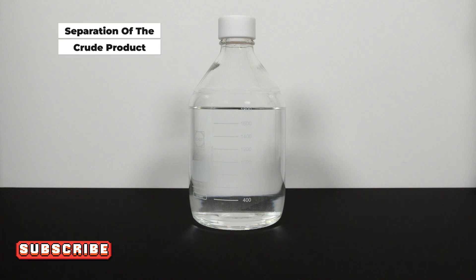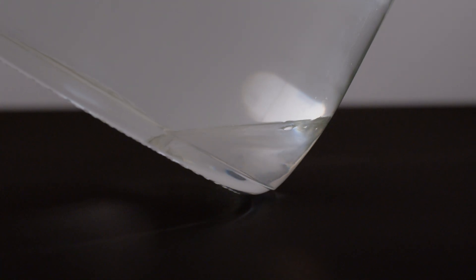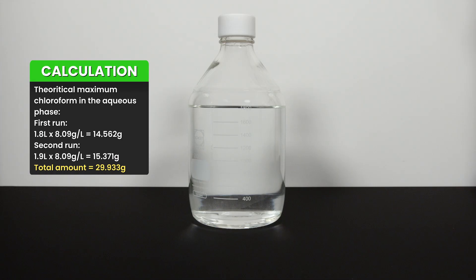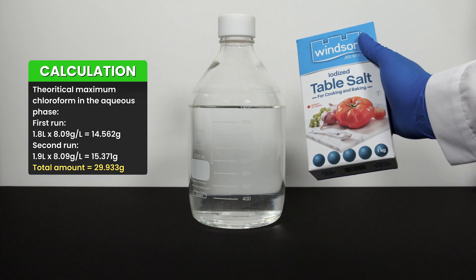After allowing the mixture to react for 24 hours, you can see the bleach solution has cleared up and an organic layer is formed at the bottom of the vessel, which is the chloroform. Chloroform is slightly soluble in water at 8 grams per liter — it might not be significant normally, but given we have almost 2 liters of solution, we better do a salting-out step to increase our yield.